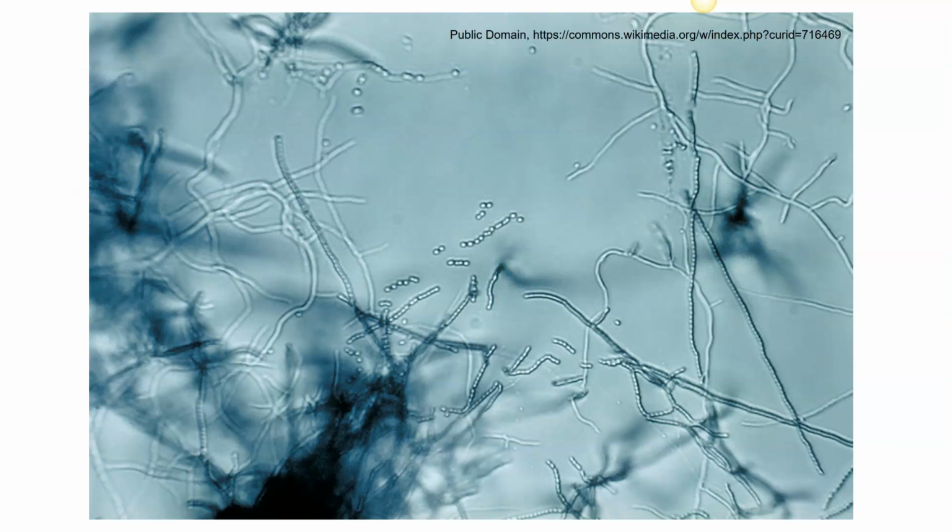These are Actinomycetes. The interesting thing about Actinomycetes, myces stands for fungus. They were originally thought to be a type of fungus where the fungus itself would break up and create these little cells. They found out that these were actually prokaryotic, and since they were prokaryotic, that automatically meant they were bacteria.